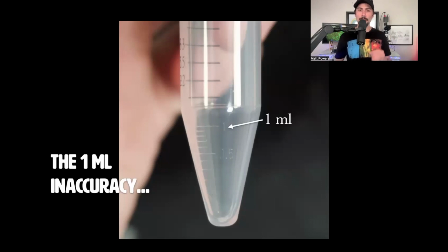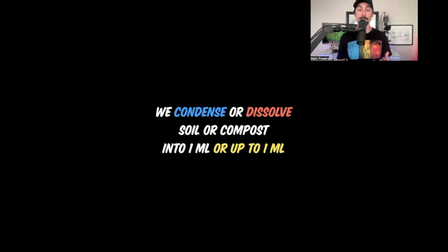But this 1 ml inaccuracy stems from the fact that everyone's trying to reach it. We're condensing the soil or compost, or we're dissolving the soil in water down to 1 ml for compacting it, or we're dissolving it and displacing up to 1 ml.